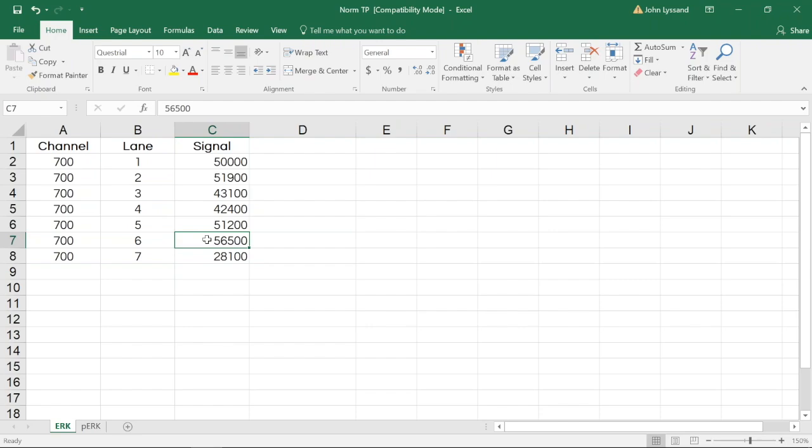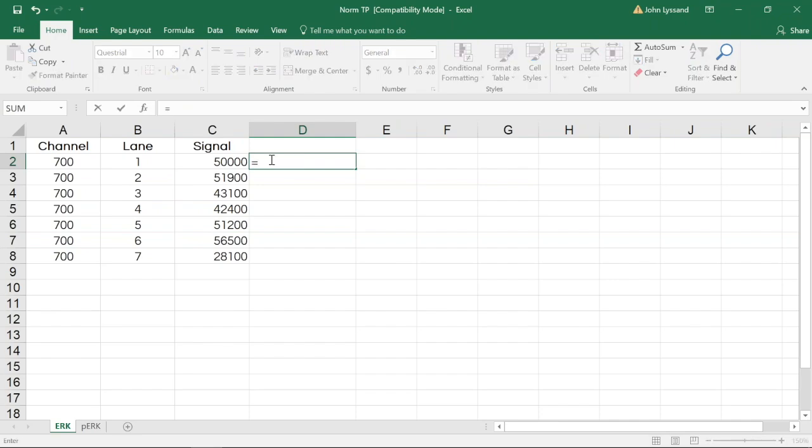Once we've calculated and located this value, what we'll want to do is divide the other lanes by it. This can easily be done in Excel by dividing an adjacent cell by that value. In our example, that value is 56,500.